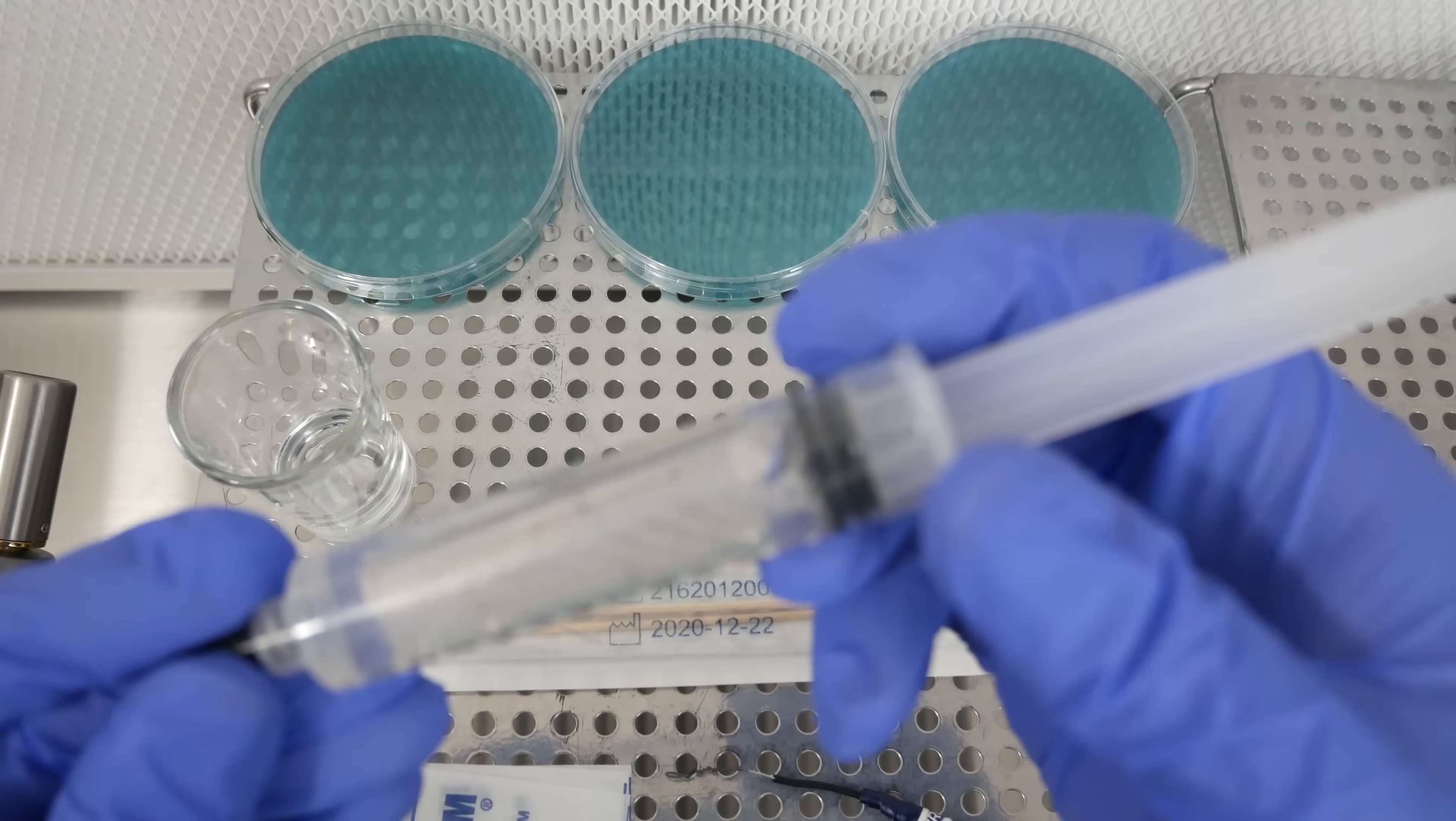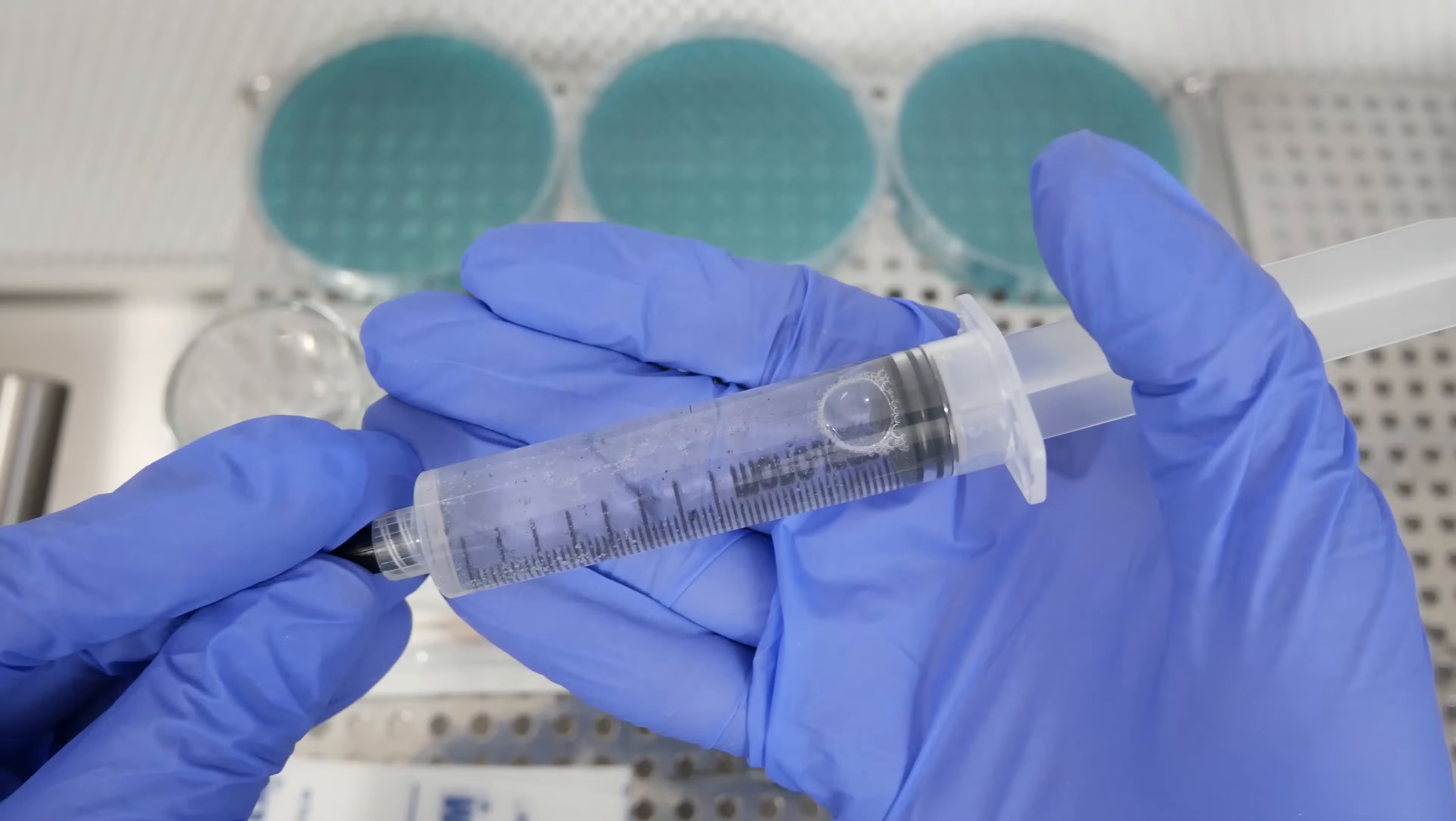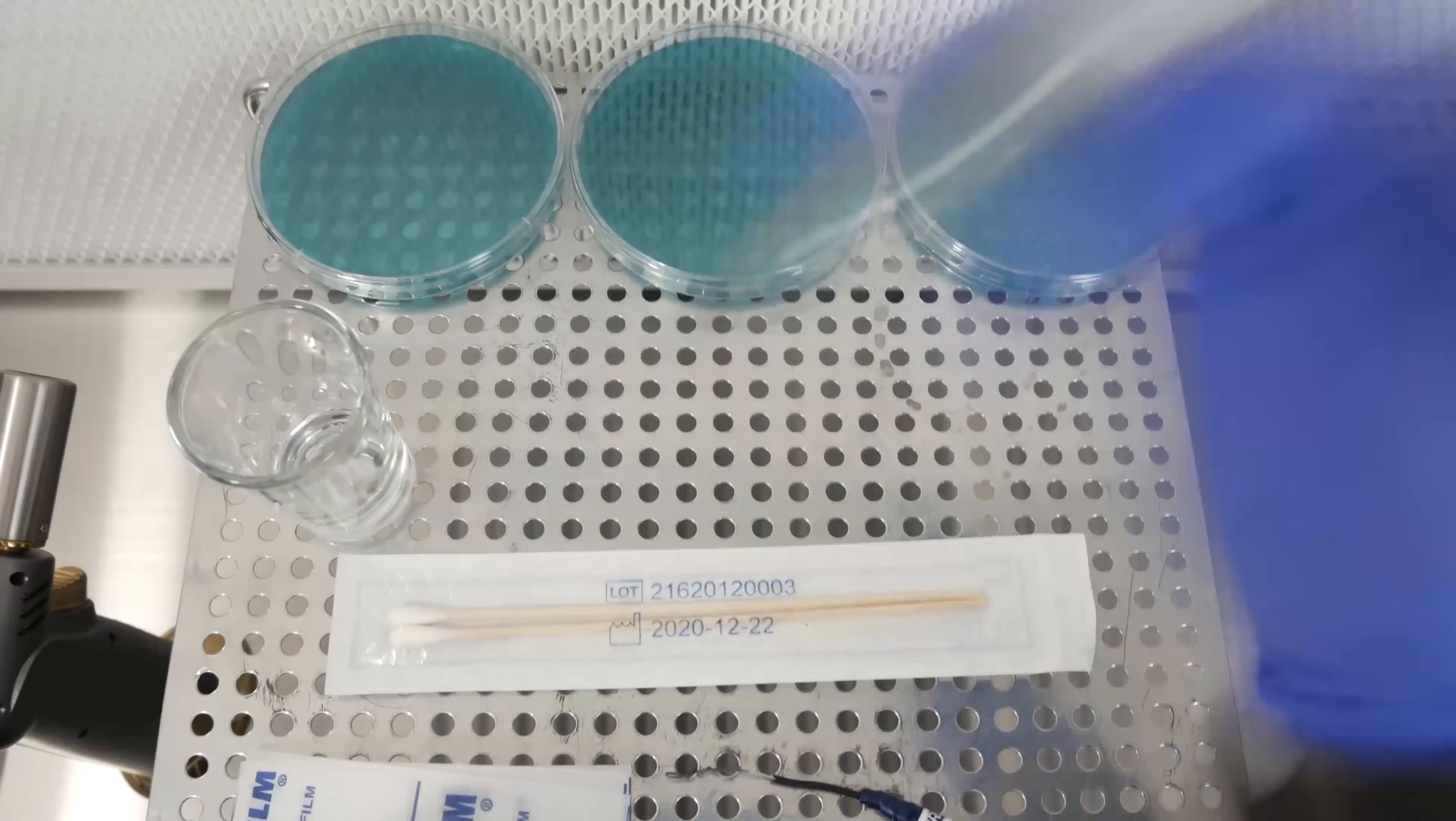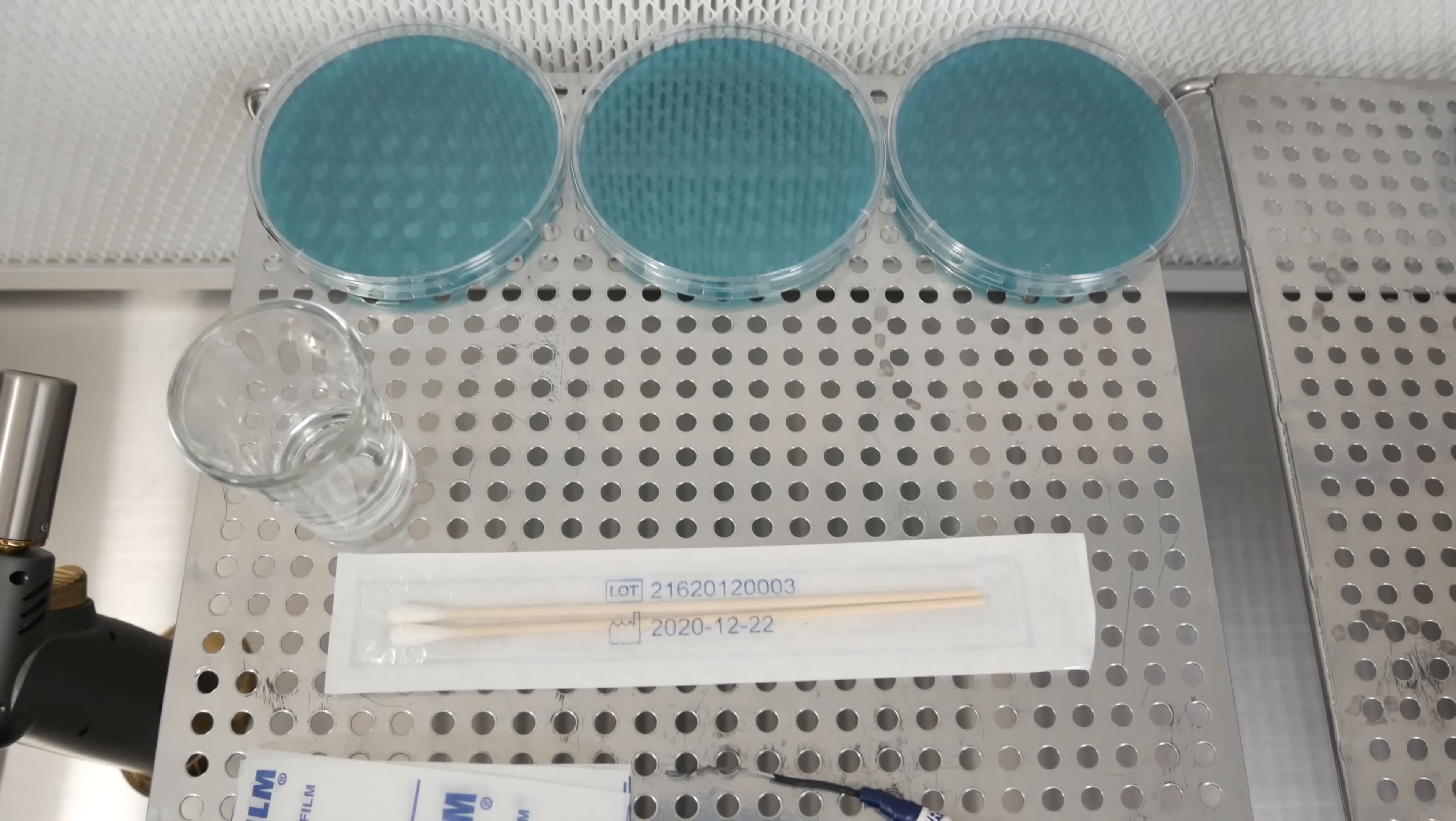Each individual black speck of spore that you see in the solution contains like hundreds or thousands of microscopic spores that you can't see with your eyes. When you shake it apart in here, you're going to distribute those microscopic spores among the sterile water that's inside the syringe.